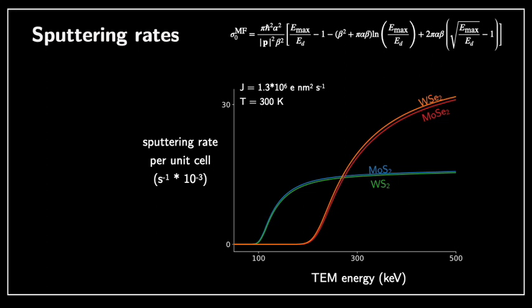And when we look at this here, there are a couple of things I want to attract your attention to. The first one is the energy scales. We just saw that ED is around 5 to 10 eV, while the energy that you need for the transmission electron microscope is hundreds of kilo electron volts. So that's what I was mentioning a couple of minutes back. The energy difference is quite significant between the energy of the electron and the energy of the nucleus. This is not that surprising, really, because of the momentum transfer and the nucleus being so much heavier than the electron, of course.